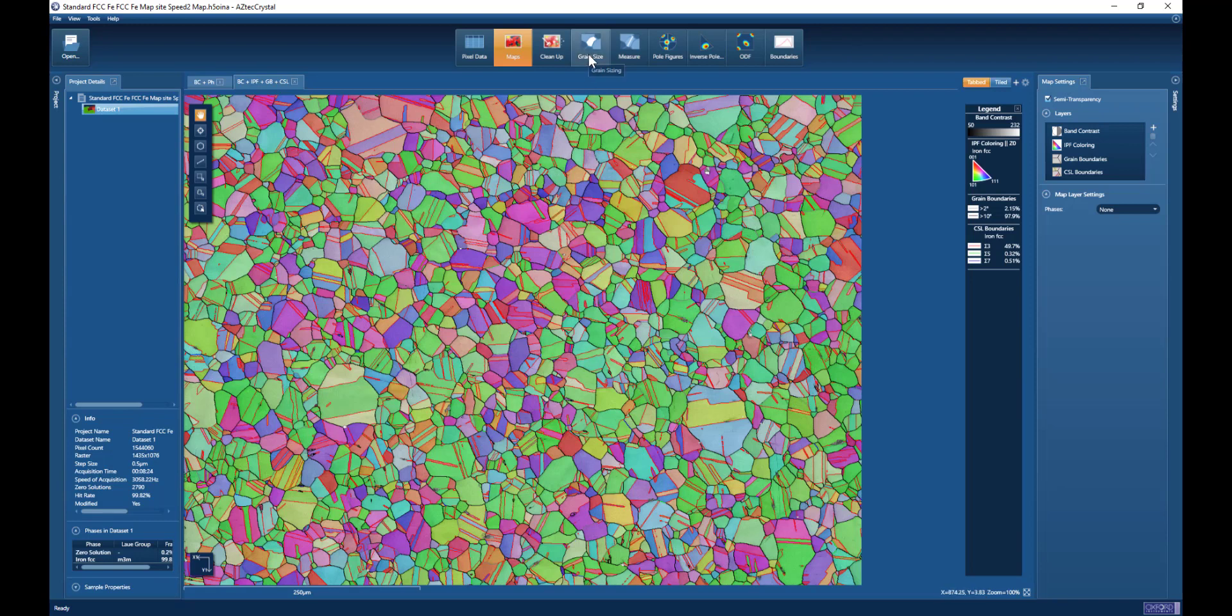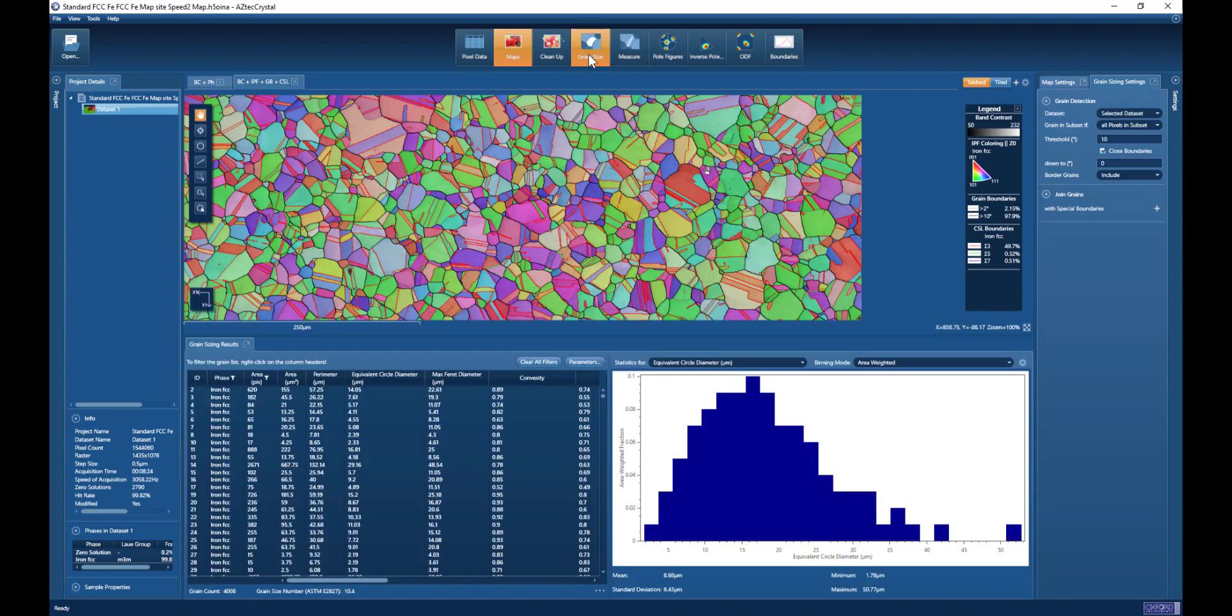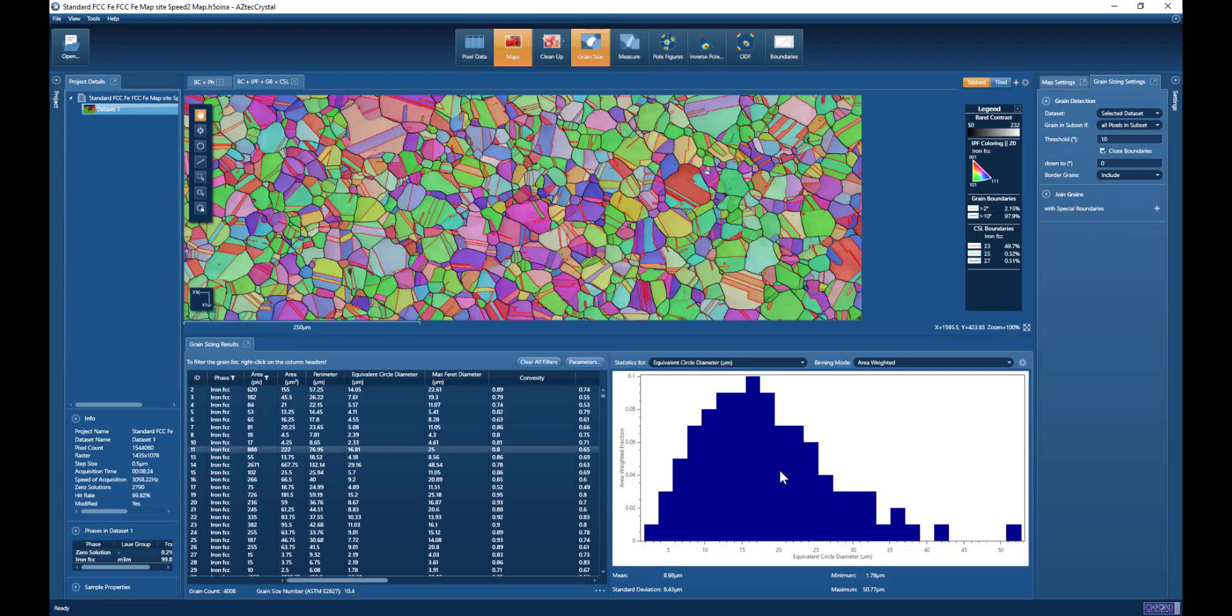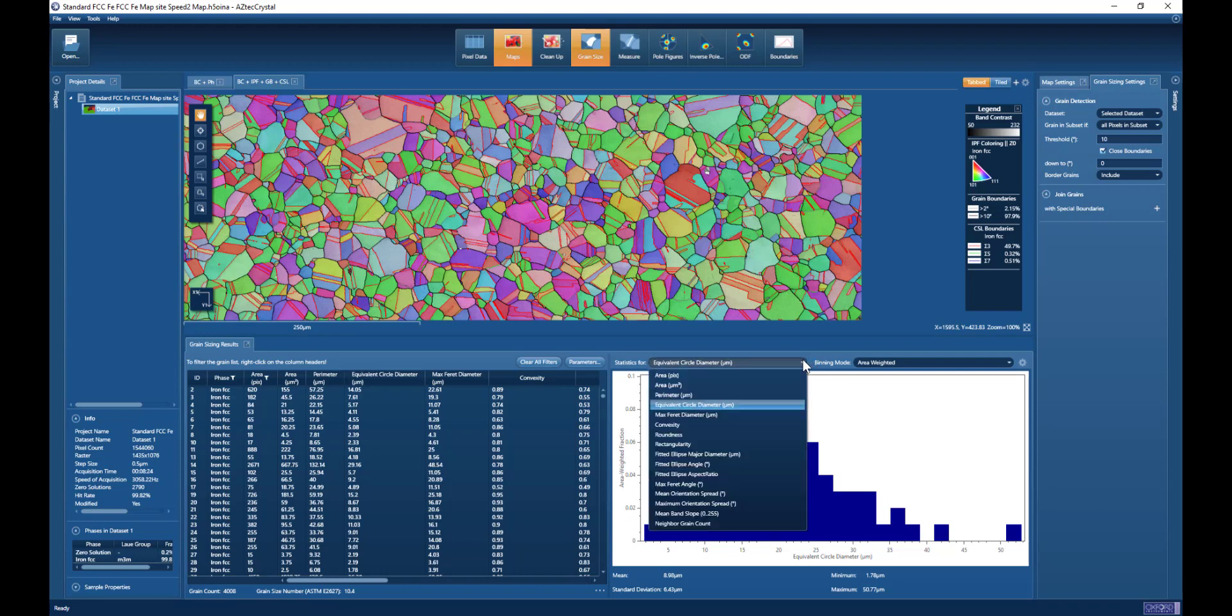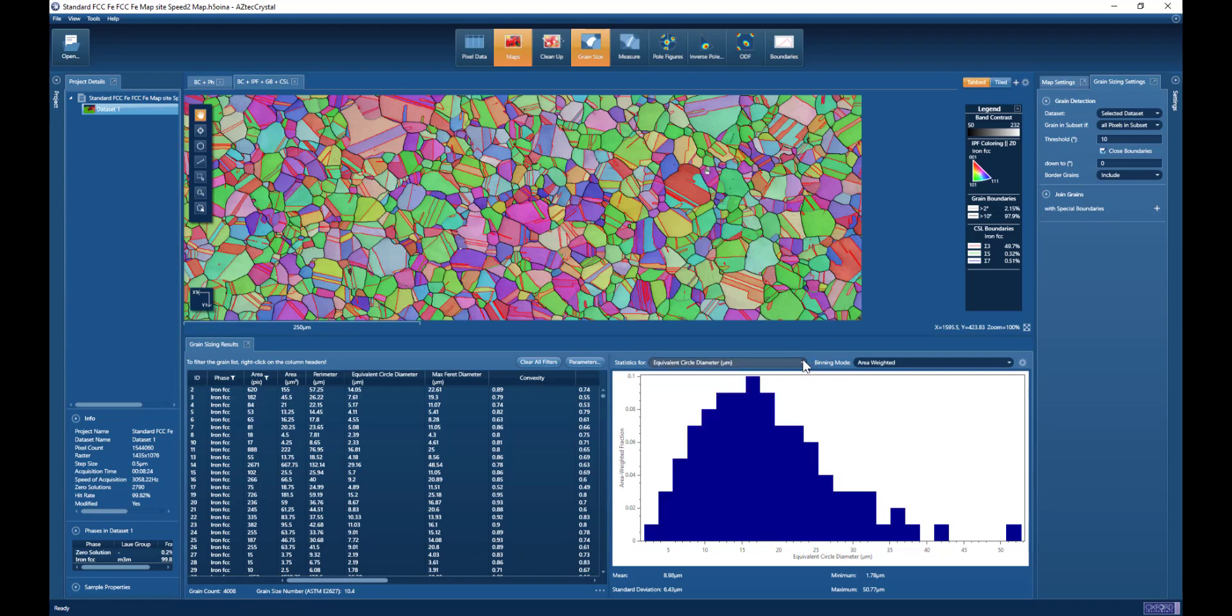We're seeing the orientation map with the twin boundaries. If I switch to the grain size viewing mode, once again we have very similar information. Here we see the grain size settings on the right-hand side. We see the grain list and the distribution for whichever parameter we select from the drop-down box.